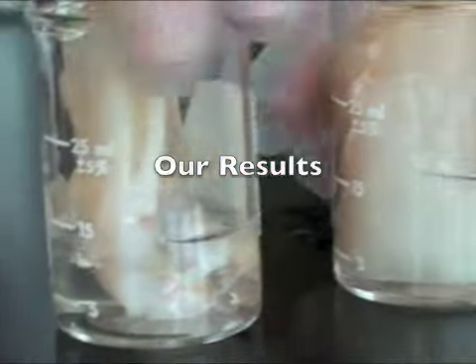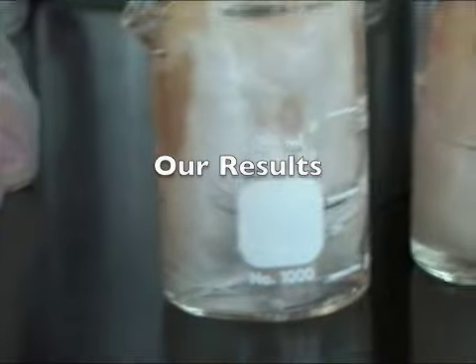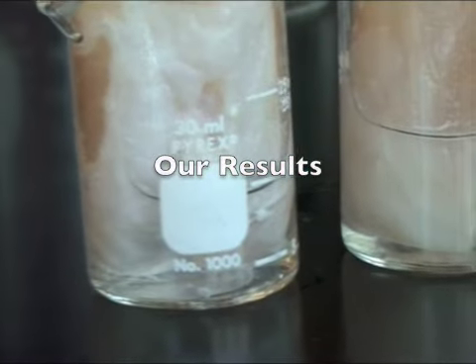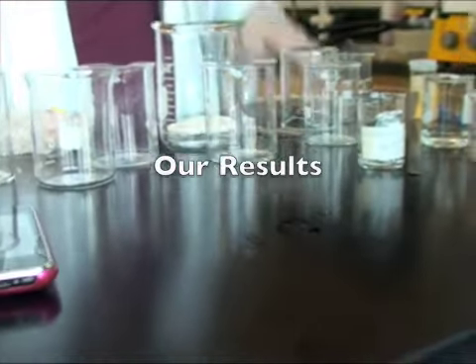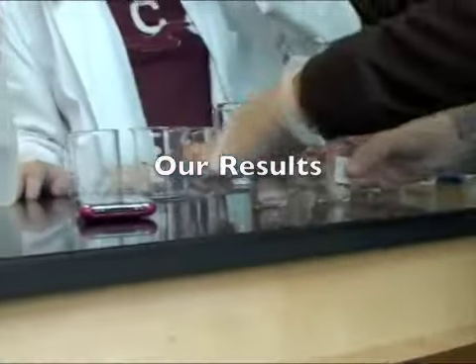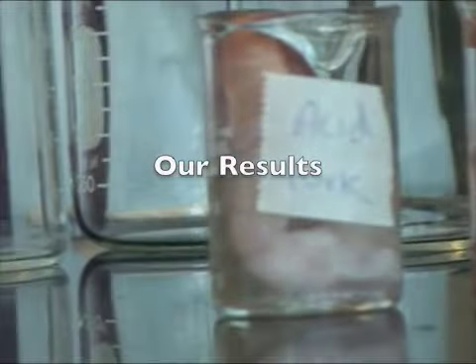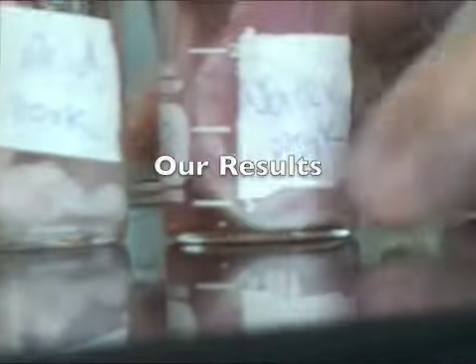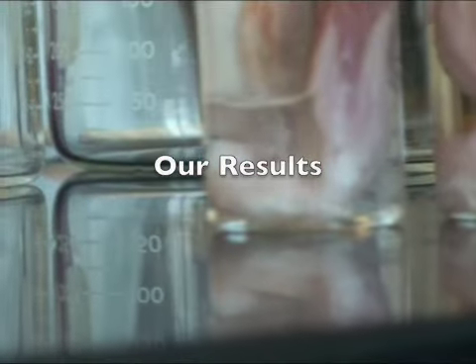As you can see, the acid fish is a lot different from the water fish. It's a lot whiter in the liquid in comparison to the water fish, and it looks slightly more shriveled as well. For the acid pork and acid water, we observed similar things. The acid pork looked much whiter than it had started and from the water pork, and it was also more shriveled.